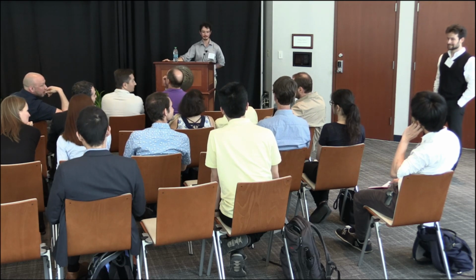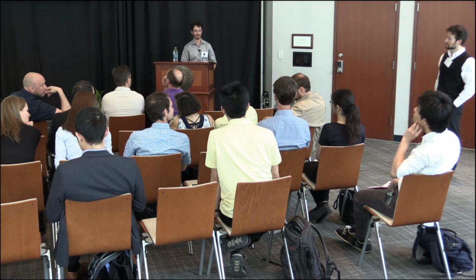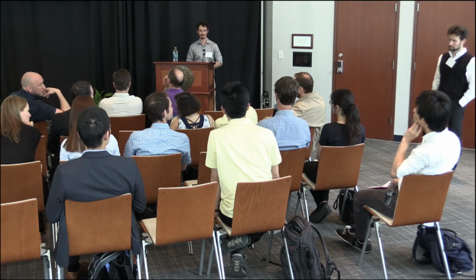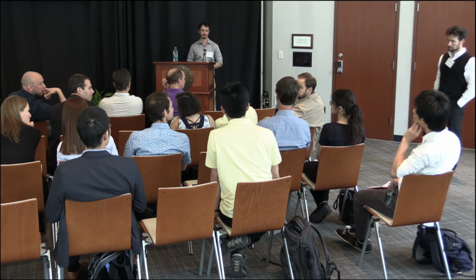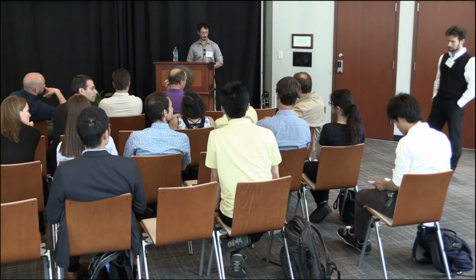But I was just wondering why you use FACS sorting. So you're not really sorting, as I understand it. It's a means to get single cells, right? We're using it as a means to get single cells. Because there are other devices, of which I forgot the name now, using a piezo mechanism to get nanodroplets of cells in microtubules.